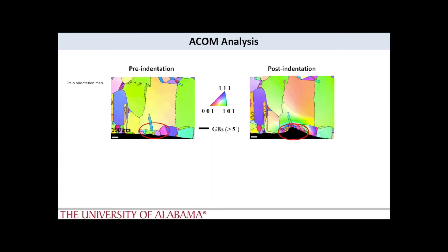So in this grain orientation map, we clearly were able, at this point, to identify the grain boundaries. In this case, we see that at the top of the surface, these are much more refined grains in here. So the indentation process obviously produced a much more fine grain structure under the indent tip, which was clearly not visible in the bright field image.